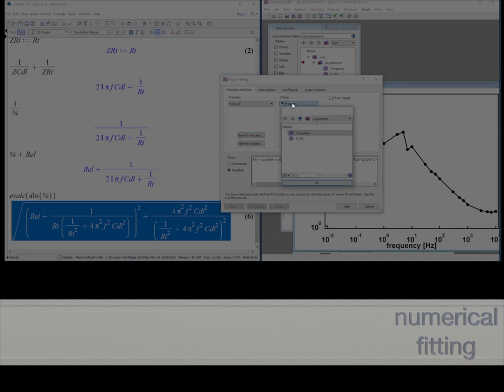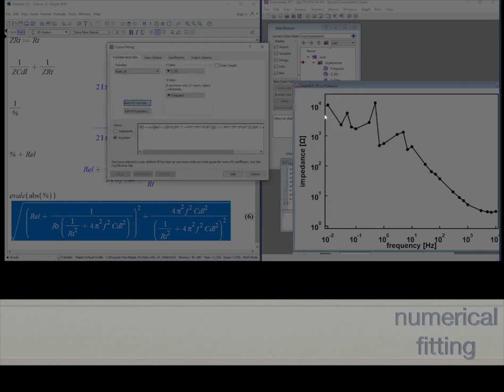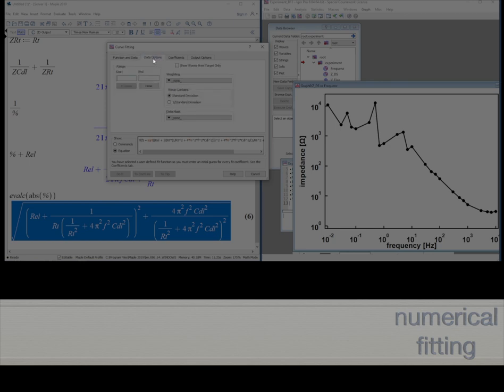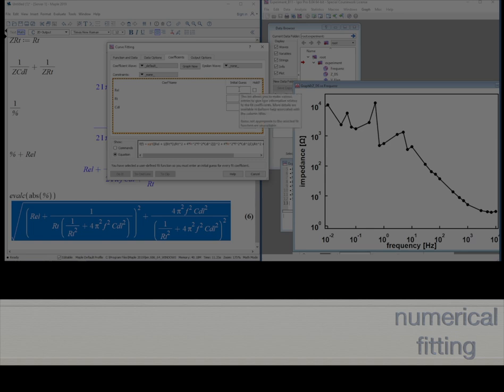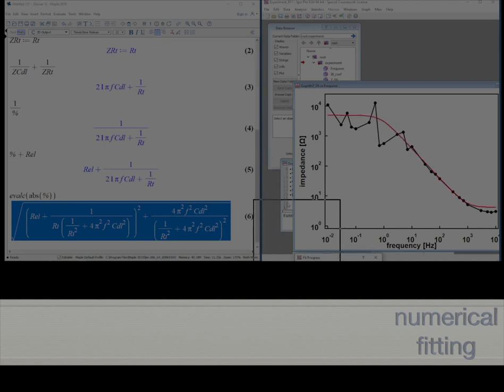Our y data are now the z, the resistivity of the double layer of our student, and then as independent variable, the frequency. Now we must introduce coefficients so that the Igor system has some starting point. We go to coefficients and say, okay, REL, how big would it be? Let's guess it's around 15 Ohms. The RT would be around 10,000 or 20,000. We do not know, so let us take 20,000. The double layer capacitance is usually around 100 microfarads, so let us take 100 microfarads. We say not to hold any of these coefficients, but just do it. He does the fit, and it is pretty good.